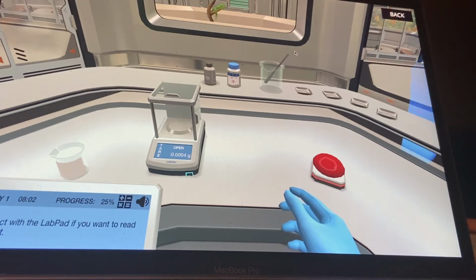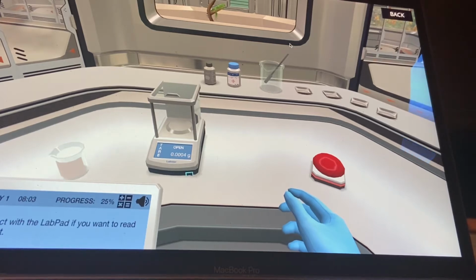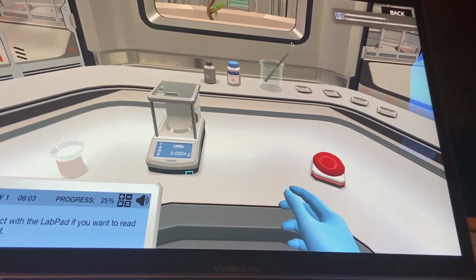Secondly, I've set up a handy red button for you, both here on workbench 1, and on workbench 2 in the next room where you'll go a little later. Whenever you click it, I will reset the materials on the workbench you're at, and take you back to the most recent checkpoint task for preparing the solution. If you ever get stuck because you did something the wrong way, or want to experiment a bit, just click the button to try again. And don't worry, I won't make you restart completely, but be careful with it still. Clicking it will also reset your workbench even when things are going well. Let's get started with the solution, shall we?